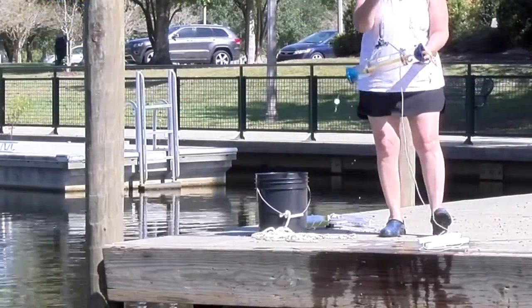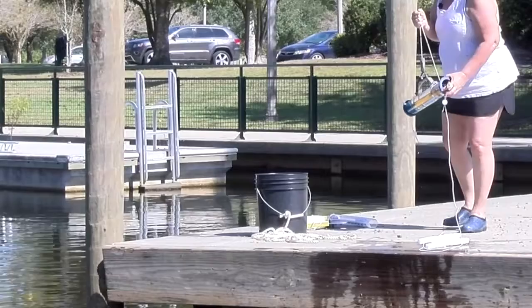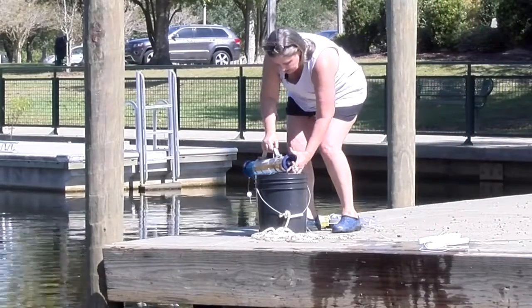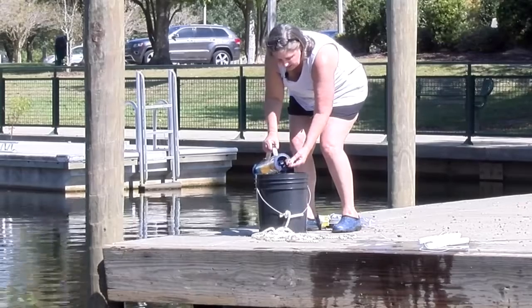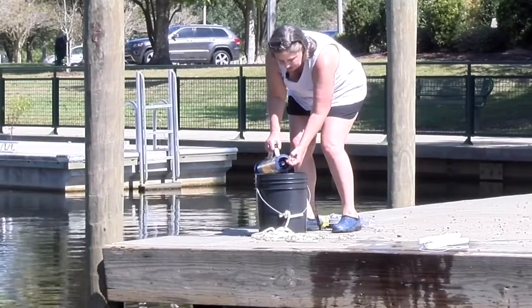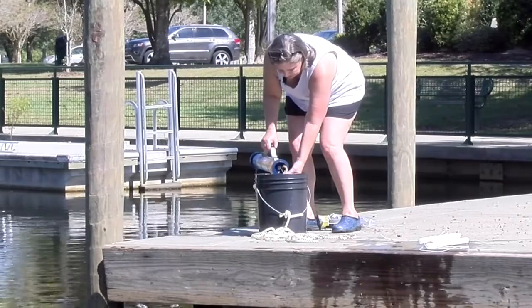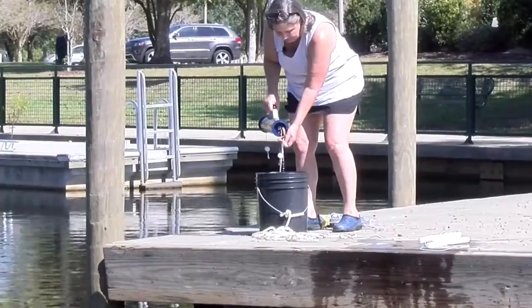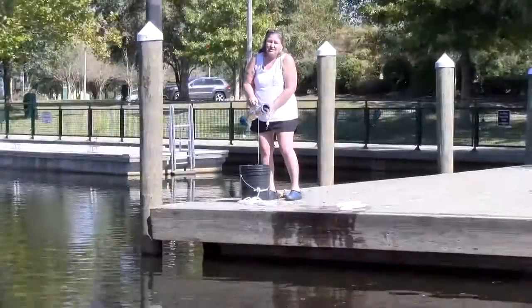And when you want to get the water out of the Van Dorn to make your sample, you loosen this tubing and the water will flow out. And then you can test your water.